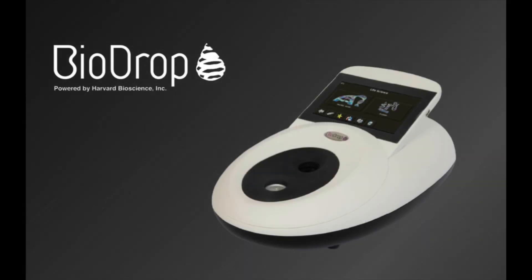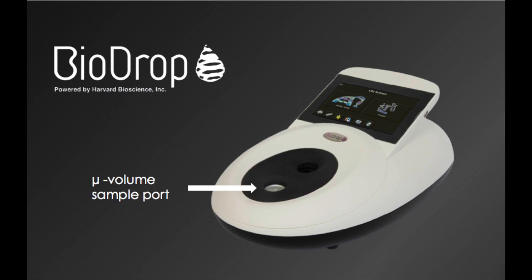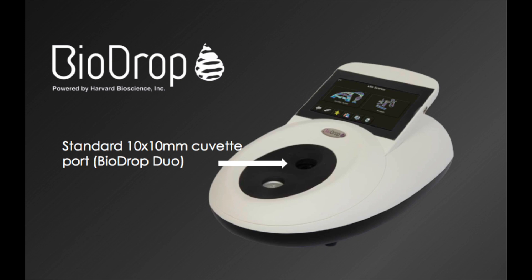The Biodrop instrument from Biochrom is a microvolume spectrophotometer. It has a unique microvolume sample port and in the Biodrop Duo also has an additional standard cuvette port.